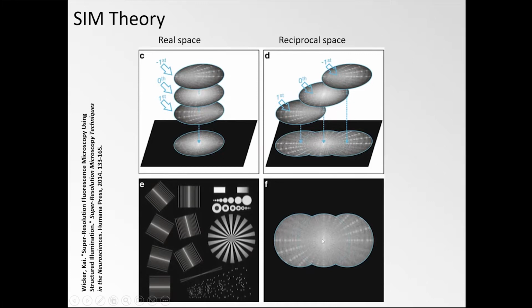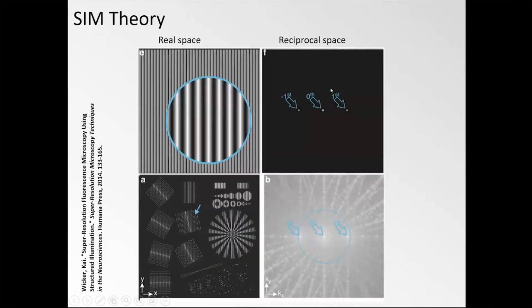And if you measure it, if this is kind of the normal distance to the cutoff frequency, it can actually in most cases go out twice as far. Why can it go about twice as far? It essentially depends on how fine that fringe pattern can be. So the finer the pattern here, the further out these dots are, and the further out these shifted copies are.